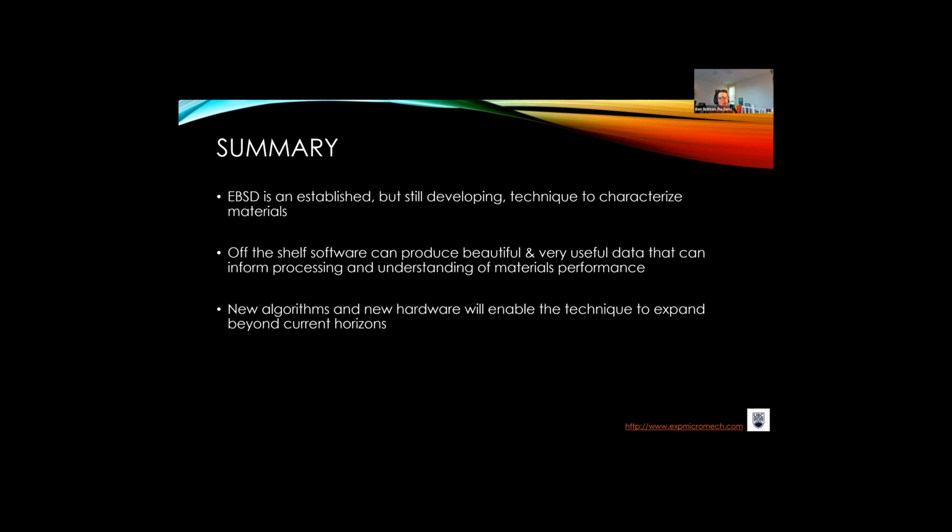phase and orientation. So I have to say the second piece of hardware that I'm not talking about is all my data. We have some very big data arrays. I think we now probably have like 150 terabytes of EBSD data that's been collected over the years. And with the 3D data sets, we're probably going to be generating 30 to 50 terabytes per year. So it's slightly scary in that problem. I can imagine that starts to become a problem.